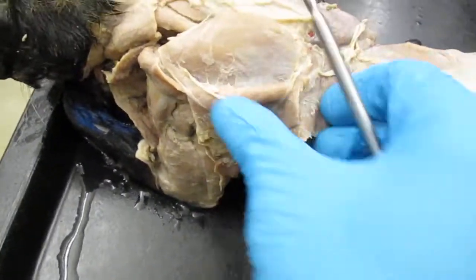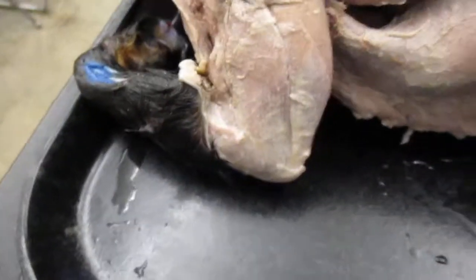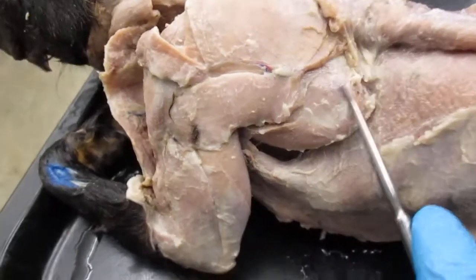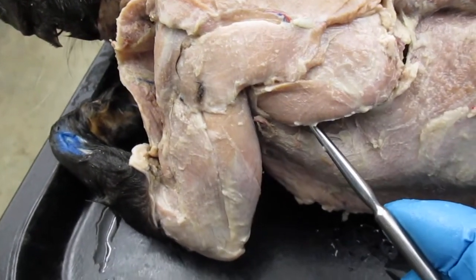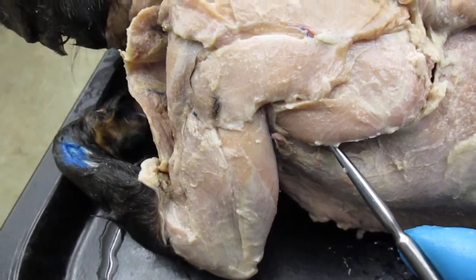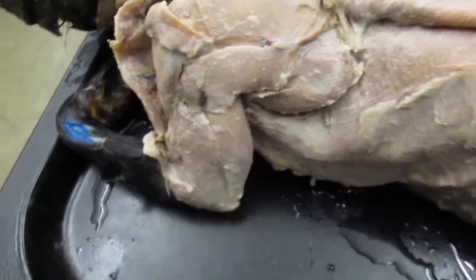So supraspinatus, and then you can see right here the infraspinatus. What is this one here? That's your teres major right there.